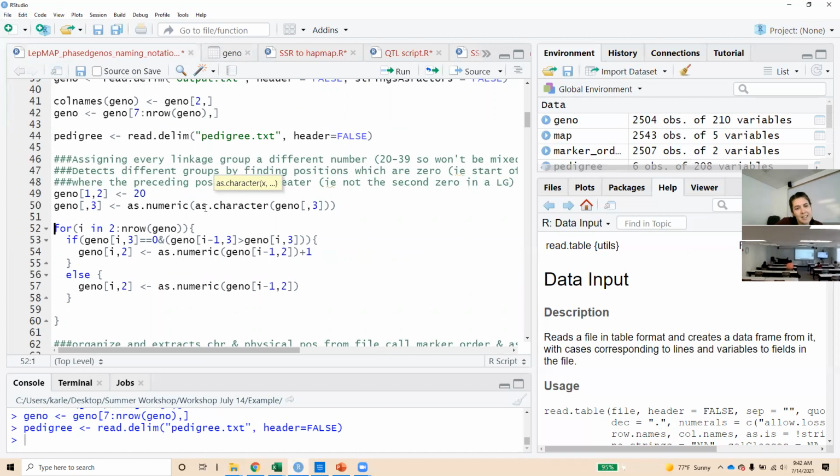As character, so you both to character and numerical, they will recognize. Usually it's good practice when converting to numbers to have it store it as plain text first. So as actual text, not as a number. Because what I'm doing here is making sure nothing's stored as what's called a factor. And if you don't store it to plain text first, it can mess it up and not actually recognize it as what is actually in that cell.